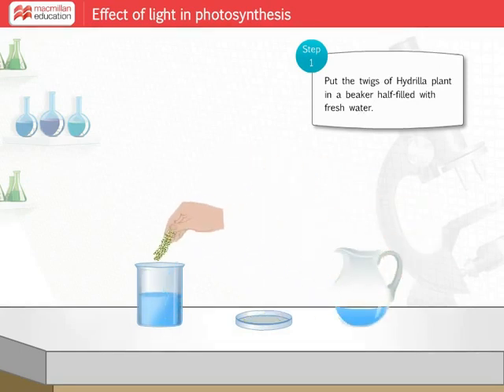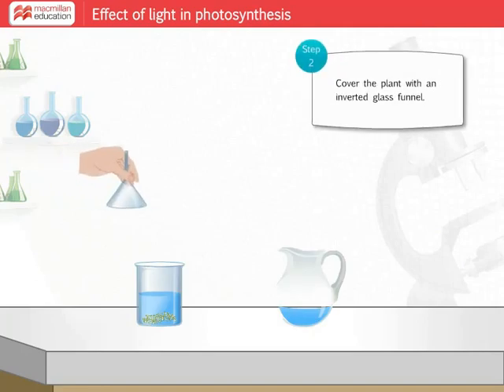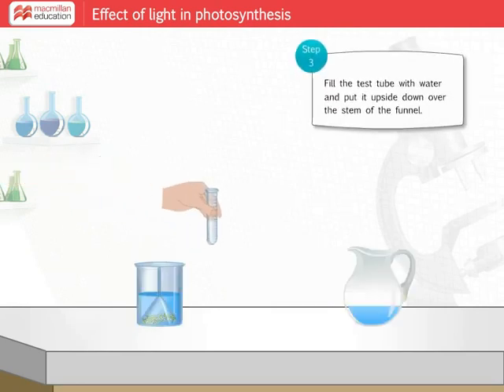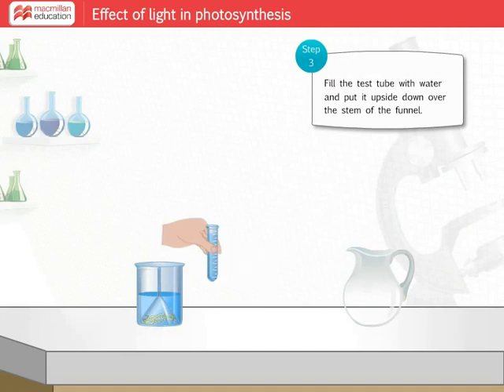Add the twigs of hydrilla plants in it. Now cover the plant with an inverted glass funnel. Then get a test tube and fill it with water as shown. Now invert this test tube on the stem of the funnel.